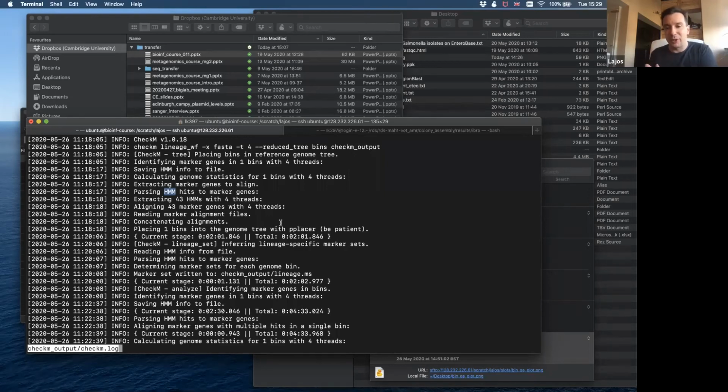But as soon as you have the same gene, but probably encoded by a very different DNA sequence, just because it maybe evolved as a paralog, but encoding a very similar functional gene, then you have to go to the protein sequence and use the HMM search.